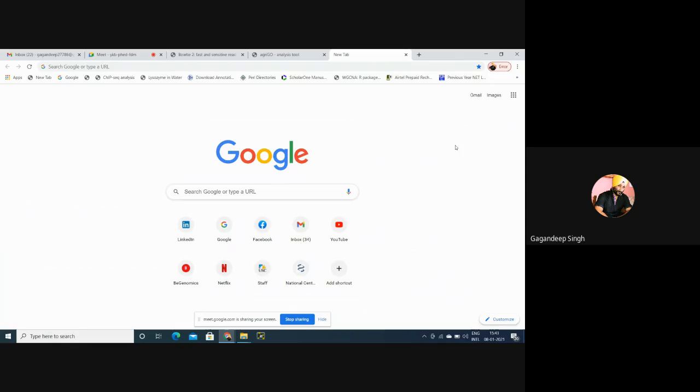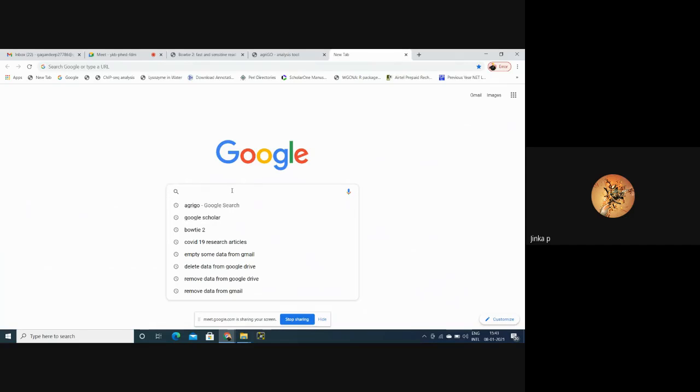Have you assembled the data in your own laptops that I have shown you the technique by CLC Workbench? No, sir, because I don't have the tool access. Okay, no problem. So what I'll do, I'll just download the data and I'll try to find some annotations of the data. Okay. For example, at NCBI.